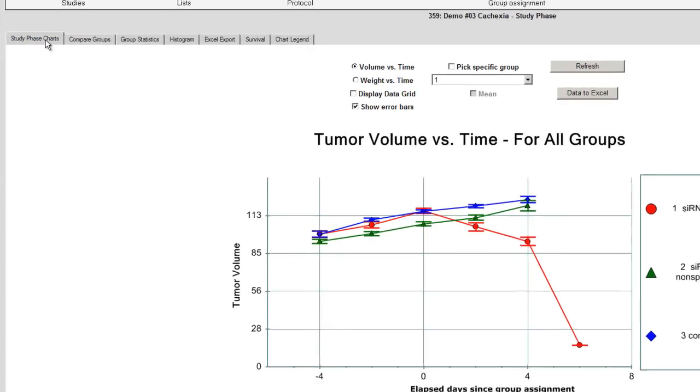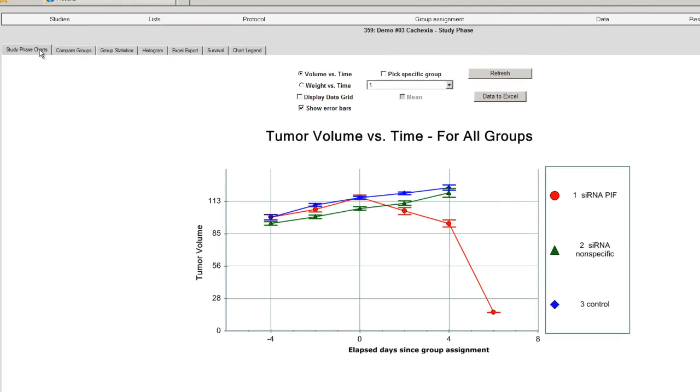So now I've showed you all the types of reports, charts, and graphs that you might expect. And like I said, we'll certainly add more for you. There's an open architecture. It's very simple to add additional charts, graphs, and statistics.